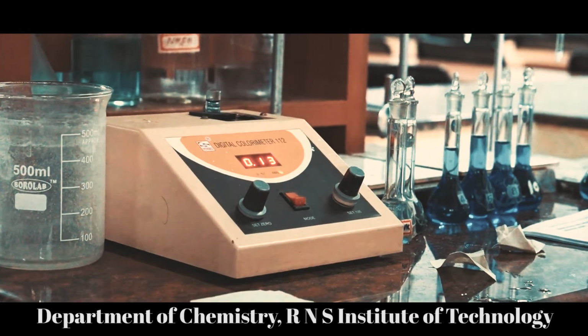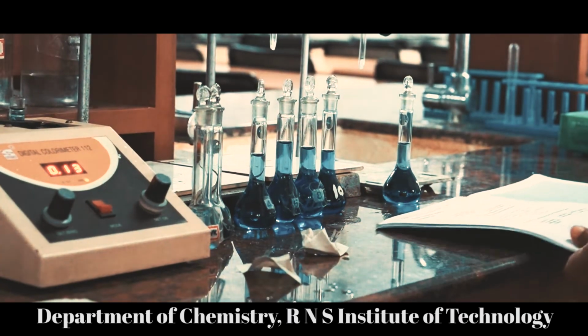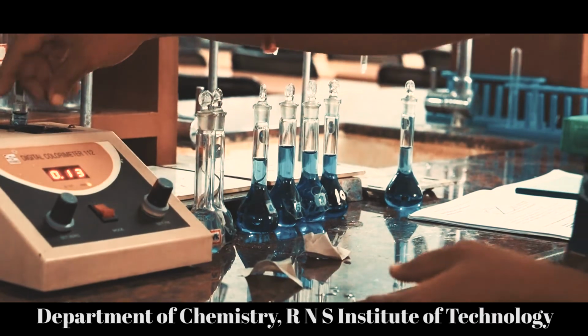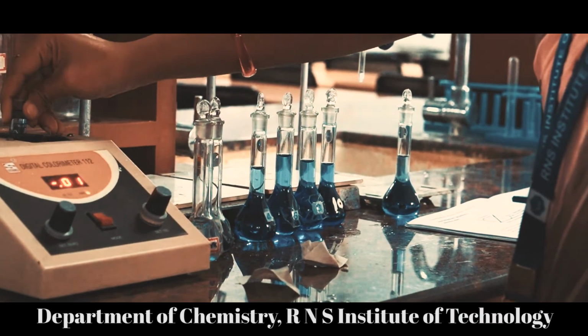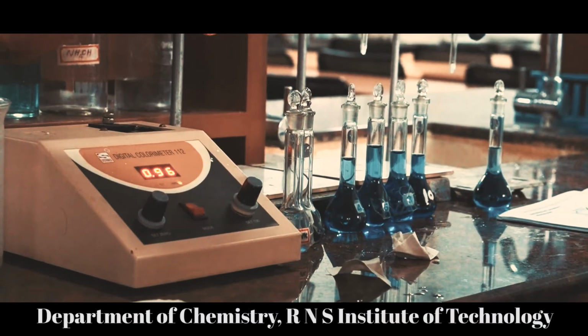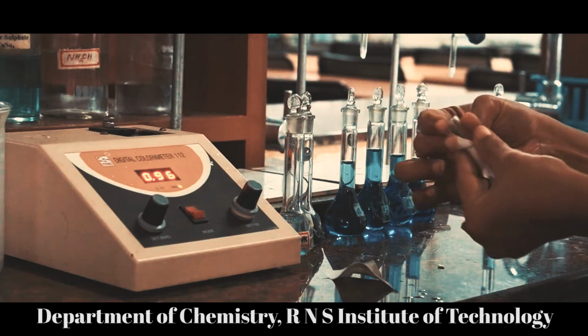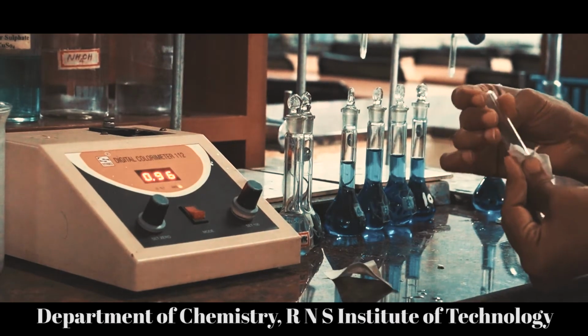Flask number 2, absorbance 0.13. Likewise, take the absorbance for all the flask solutions, and then finally take the absorbance for the unknown solution.